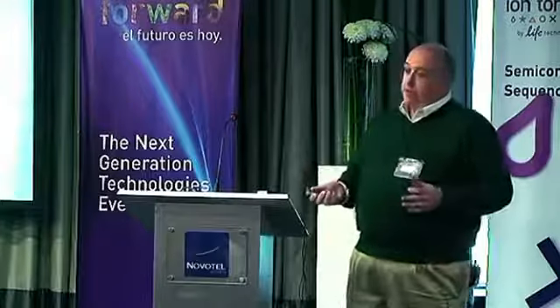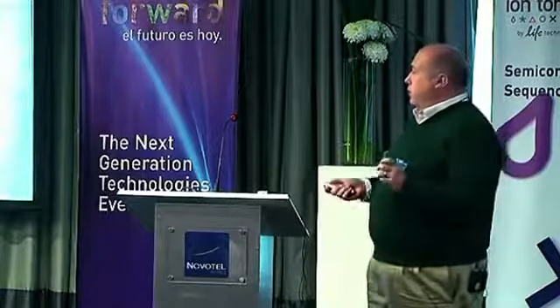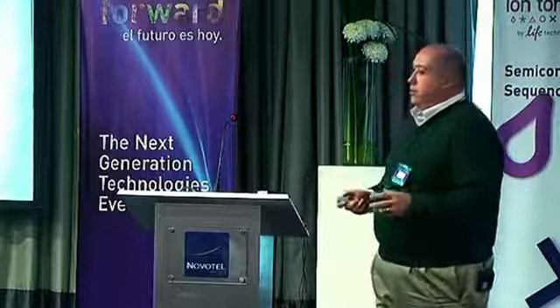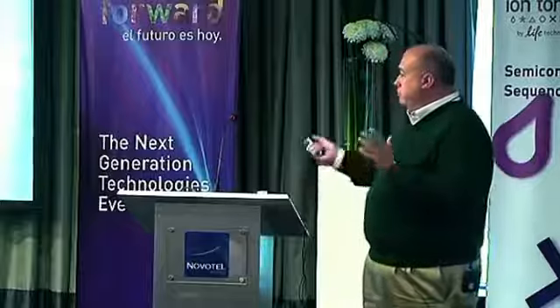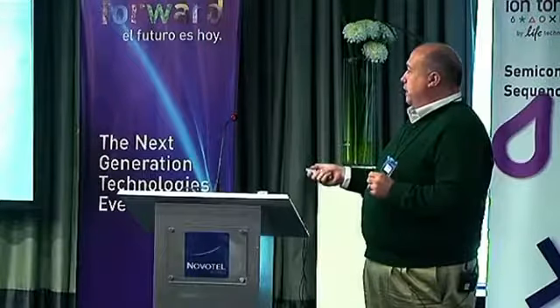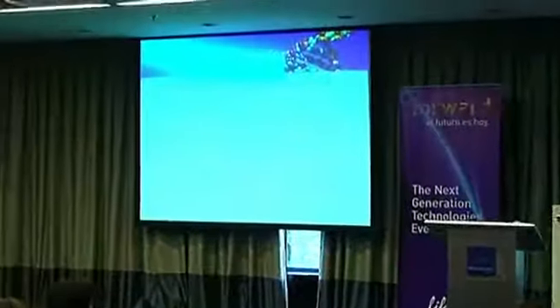And obviously we were interested from the start, but we did have a few things that we had to go through, a couple thinking points or talking points that we go through for all new technology in my laboratory. So we want to focus on 4 areas. We want to make sure that if we replace an instrument, we're not going to lose any quality. It's a very simple thing. These aren't major issues or major topics, but these are things that we hold true. So it has to maintain or exceed quality. We have to see a path to reduce costs. So we can take higher costs in the beginning as long as we see a path forward to lower costs.